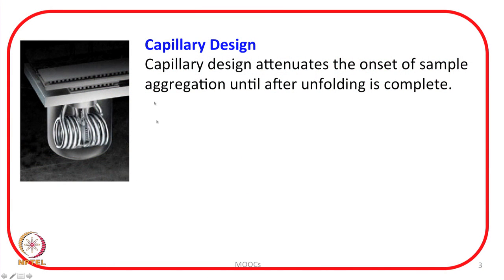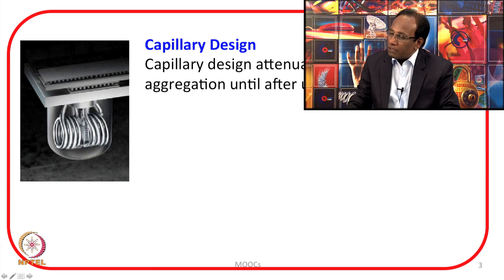This is a capillary design, and you can see the cell will have one inlet and another outlet. That means you can fill the sample from one side, and it can go through the capillaries, fill the cells, and come out from the other side.